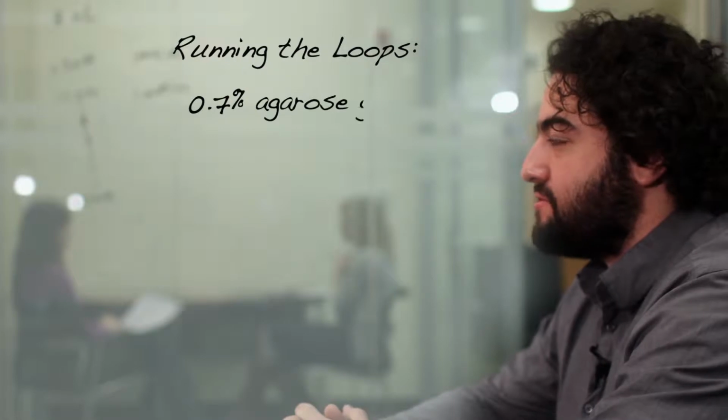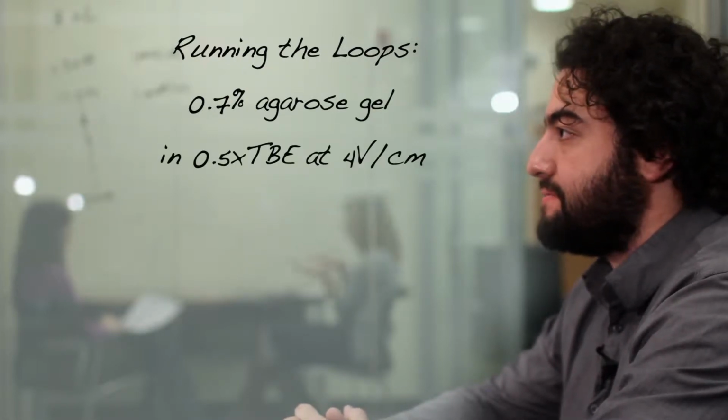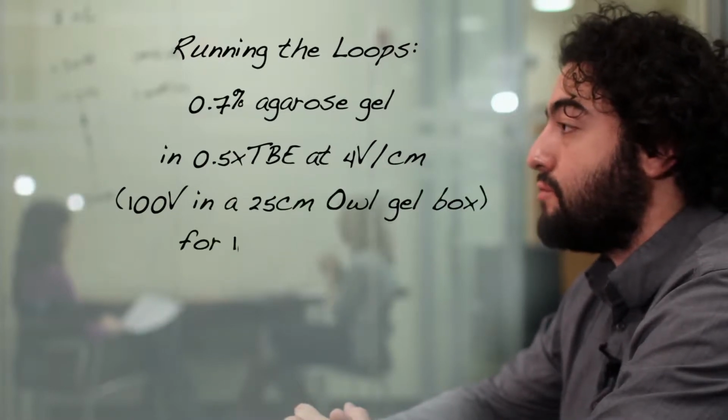We recommend running the loops on a 0.7% agarose gel in 0.5x TBE at 4 volts per centimeter. That's 100 volts in a standard 25 centimeter Owl gel box for 100 minutes. It's important to use TBE instead of TAE, since the separation of looped from unlooped is significantly better in TBE under these conditions. Other running buffers have not been extensively tested.